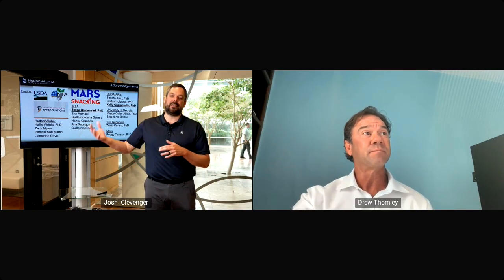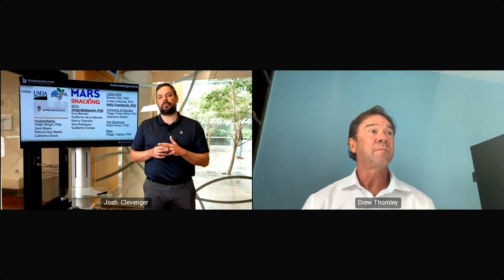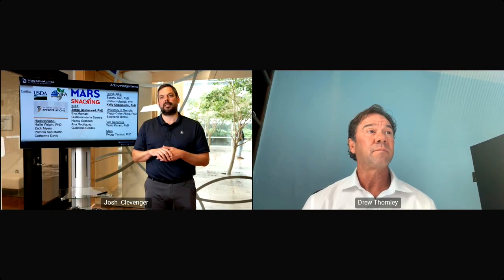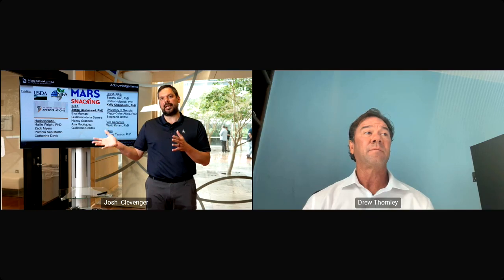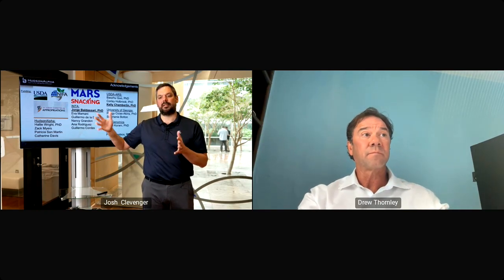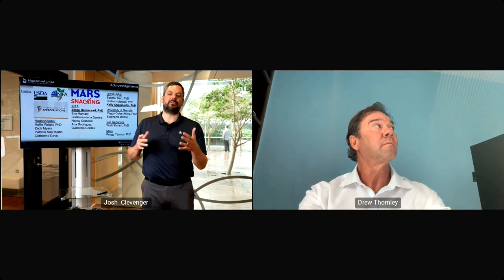Yeah, absolutely. I think that's a great question and prompt, and that's something that we're working on. I also have a company that I founded called Veil Genomics, and we think about that a lot because Veil Genomics specializes in long read, low pass sequencing, which is a way to do that graph augmentation with structural variation and SNP variation using lower coverage long read sequencing of a set of lines that are going to be important that you might not want to invest a full genome in.